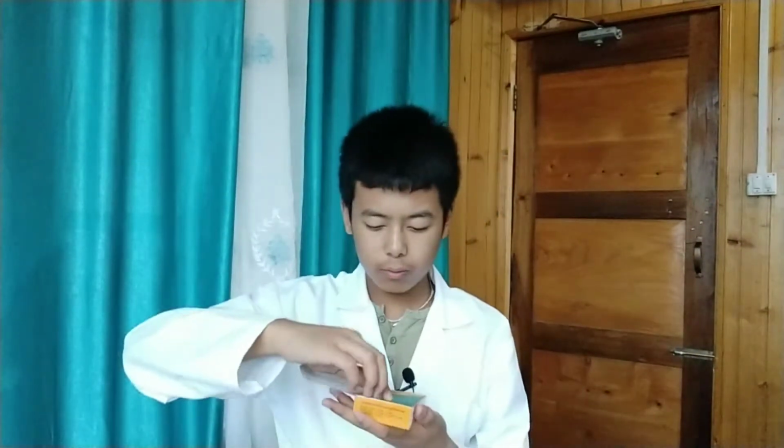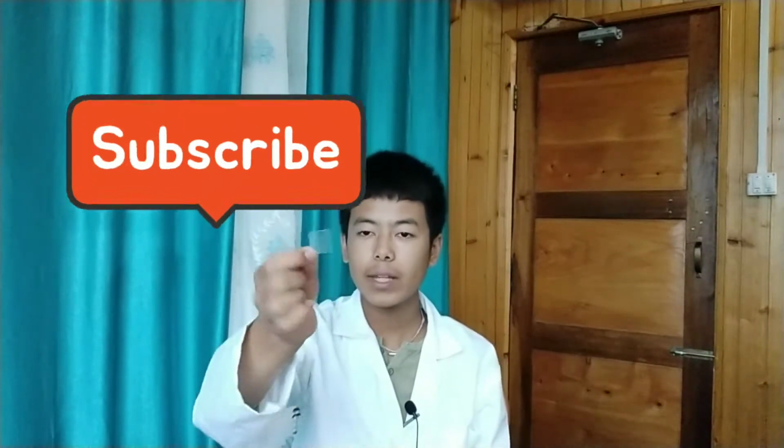Okay, and the second thing is the slides. You are really going to need this kind of slide. So this is the microscope slide, and the next thing you're going to need is a cover slip. It is also like a slide, but it is small in size and very fragile, so please be careful with it. And here I have two prepared slides. One is of monocot root and another one is of monocot stem, which I got with this microscope only. So let's keep this aside.